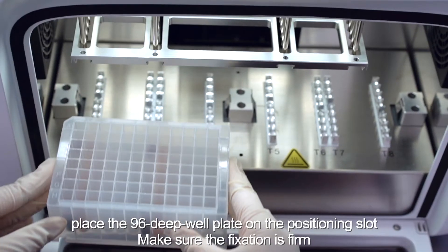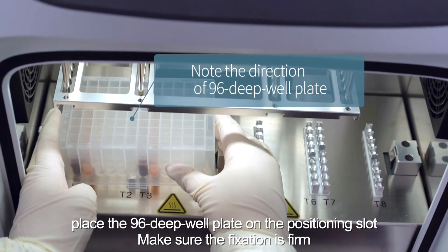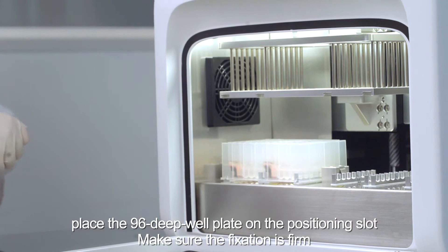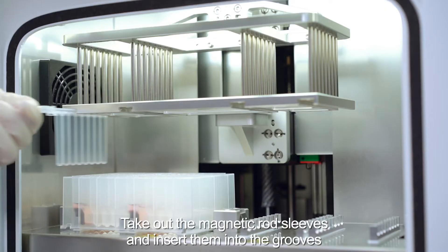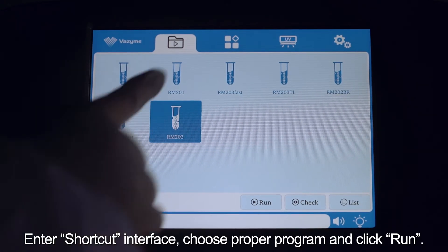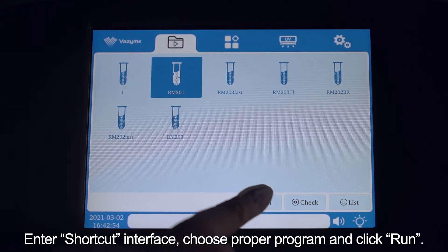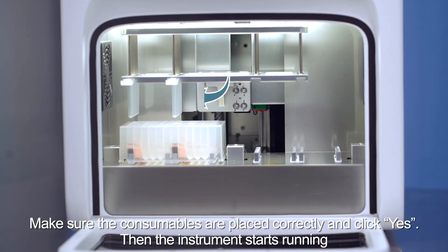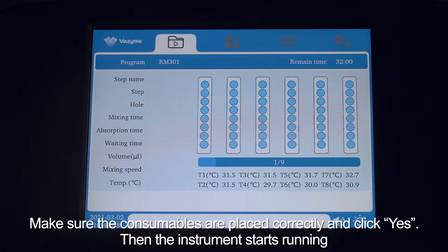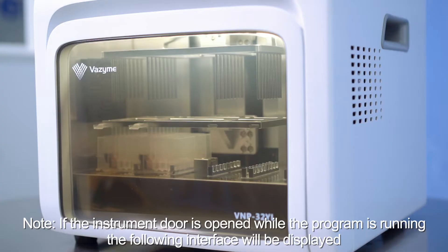Open the chamber door and place the 96 deep well plate on the positioning slot, making sure the fixation is firm. Take out the magnetic rod sleeves and insert them into the grooves. Enter the shortcut interface, choose the proper program, and click run. Make sure the consumables are placed correctly and click yes. The instrument will then start running.